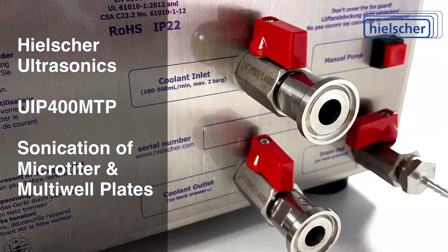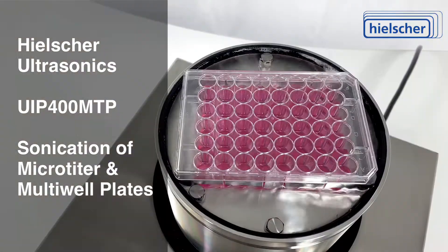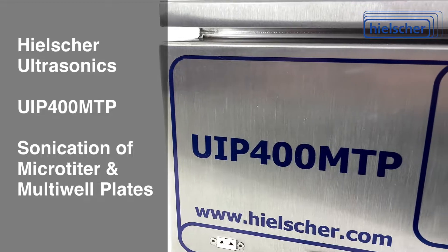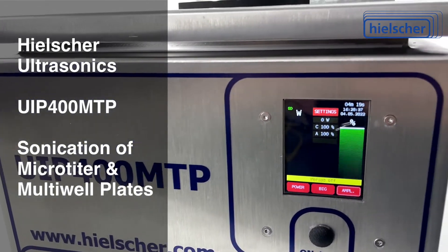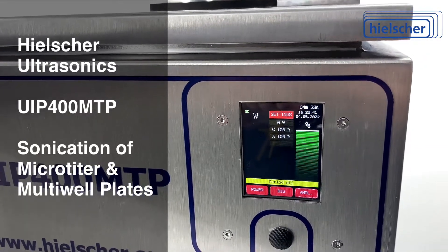You can use a standard lab chiller for precise temperature control. You can close the wells with foils or lids to avoid cross-contamination between wells. The touchscreen allows you to precisely set the amplitude, power, and pulsation cycles. The UIP-400 MTP comes with a built-in timer and temperature probe.